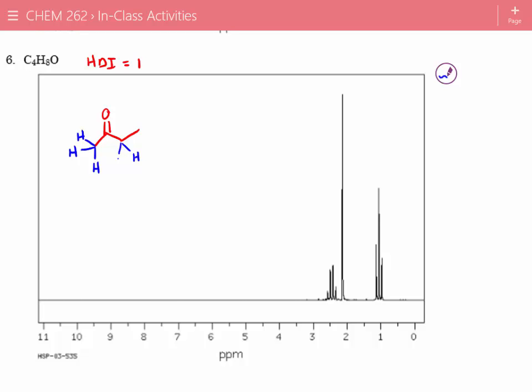We've got a methylene, which is that CH2 peak over here. And we've got a methyl group here. If we look at the methyl group on the left, these are all the same because we know methyl groups can spin like helicopter blades. If we look at the methylene protons, they'll be equivalent. And then the last methyl group will be equivalent. So this does have 3 signals, which is perfect.